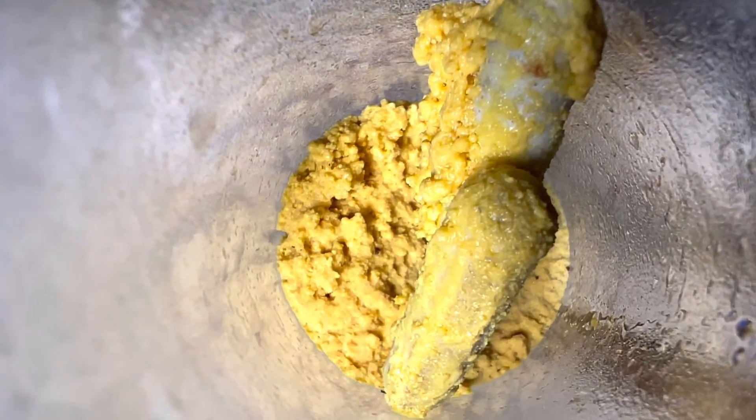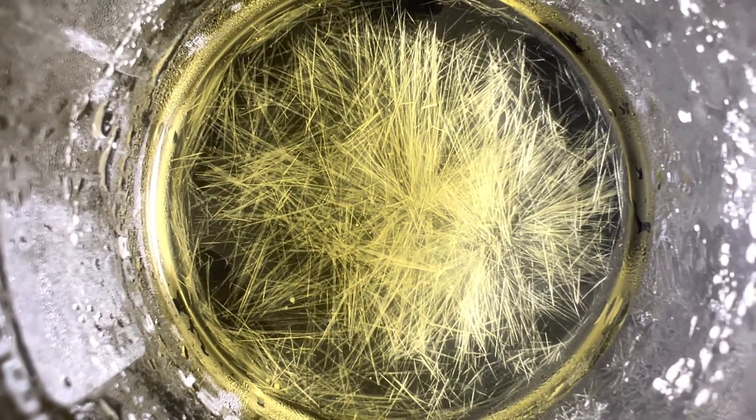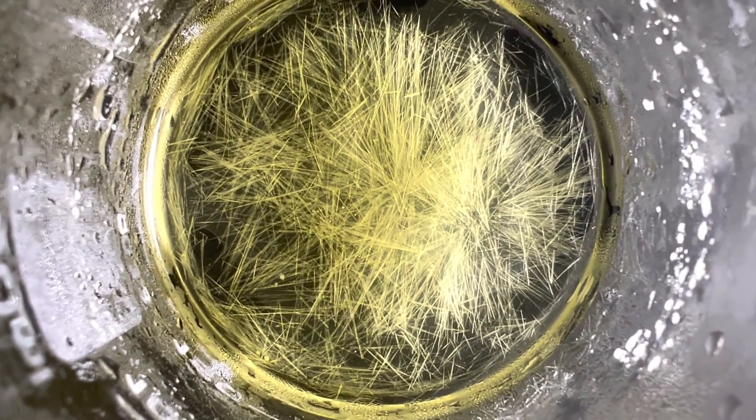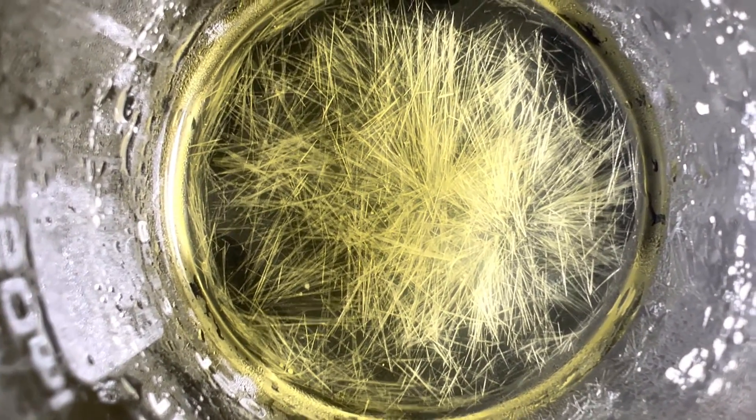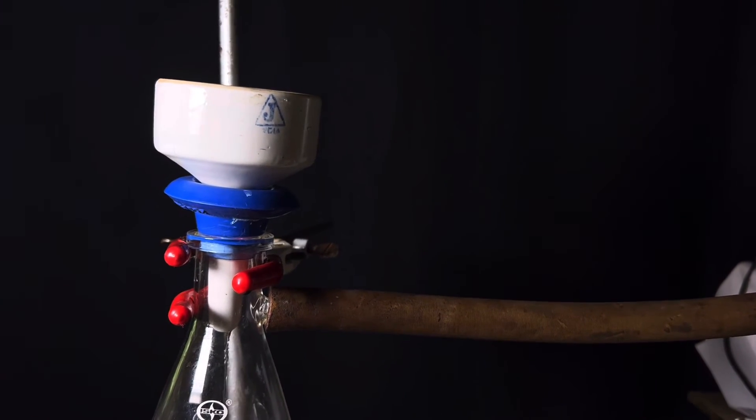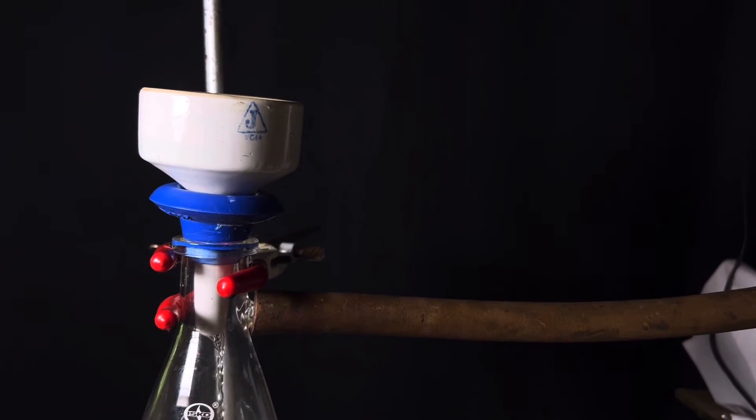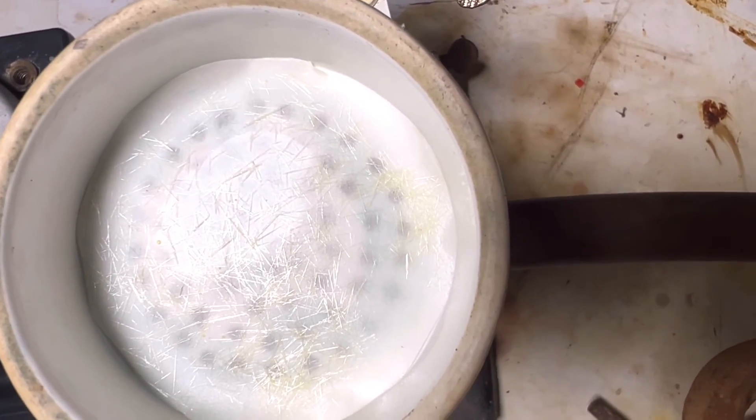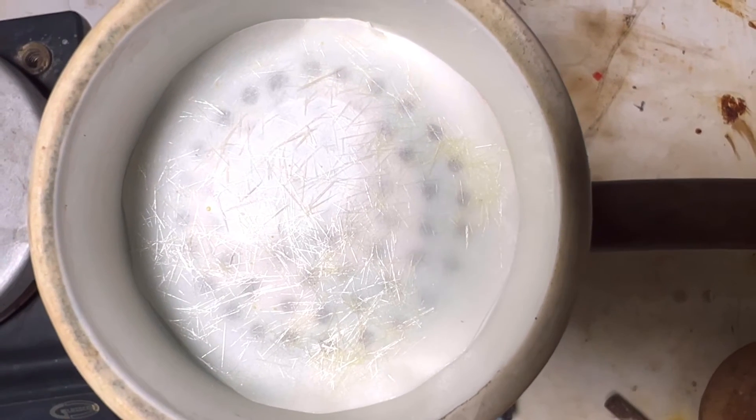The crude product was then collected from the funnel and was recrystallized from hot 95% ethanol solution to get the needle-shaped crystals of pure azoxybenzene. It was later vacuum filtered and collected.